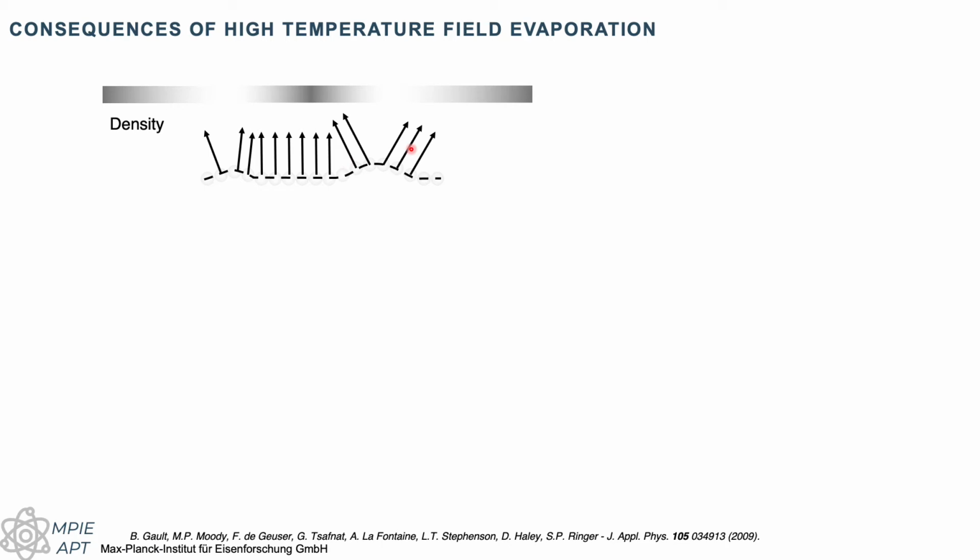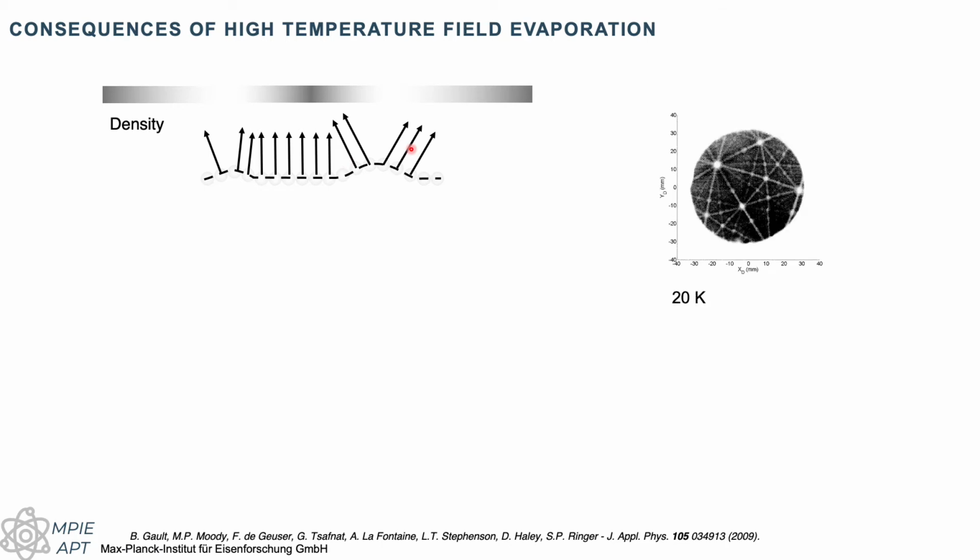And these might actually change with the temperature. So for example, this is a pure aluminium specimen. I can see a beautiful 002 set of planes here. The 111 is sitting down there. That's the 022 set of planes, and 113. We can all identify those. When we build the reconstruction, we can typically image the planes there.